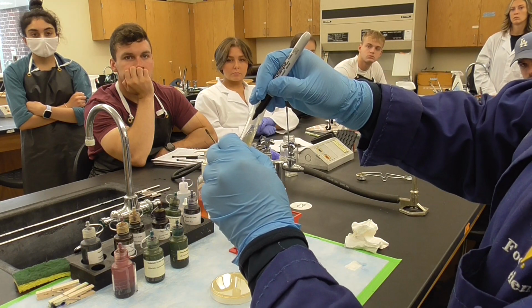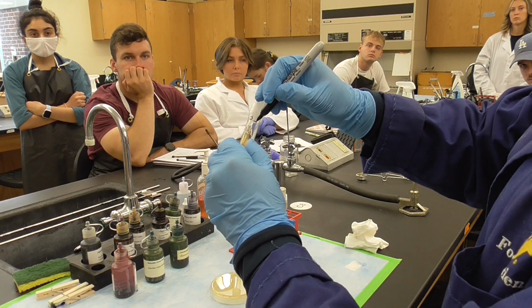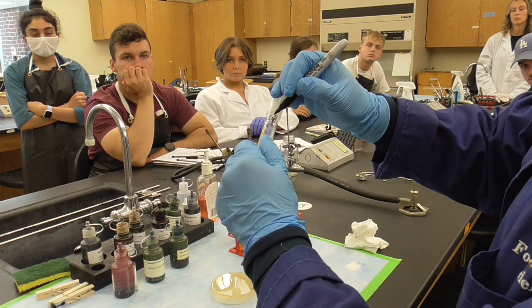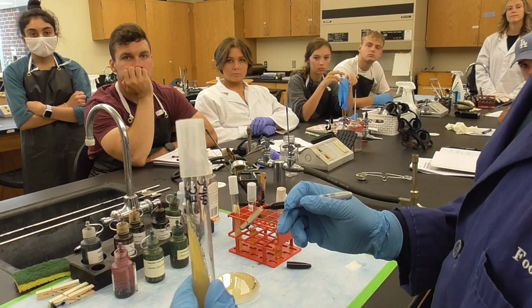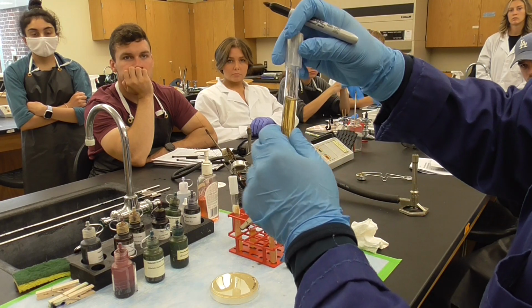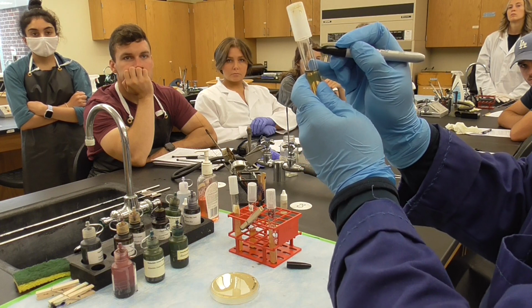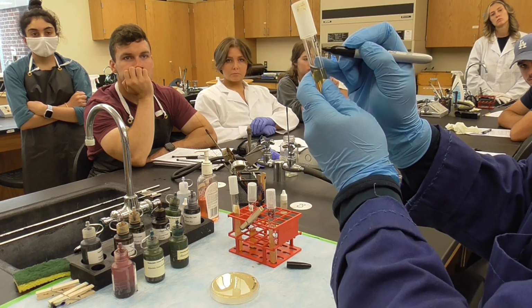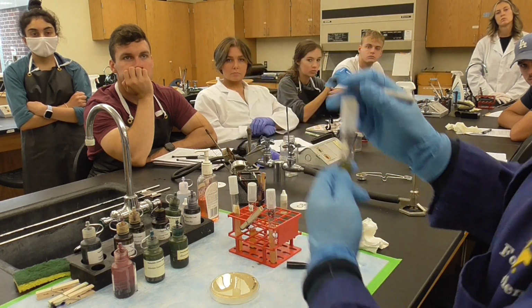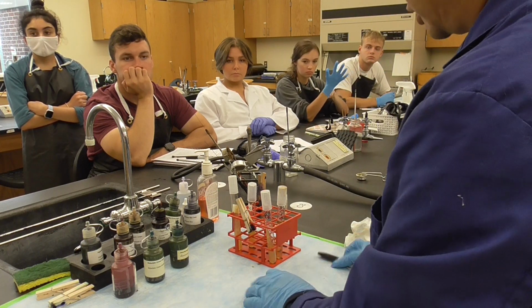So we do bench number 1, CS. This is E. coli, we wrote EC, and date we do 050905. So this looks like this. We always label at the top. So you can write bench number 1, CS, E. coli, and the 0905 is on the top. Okay, once you have all these things ready, we're gonna go ahead.